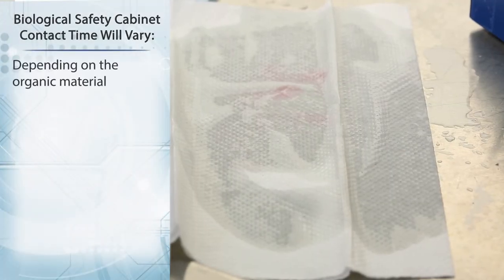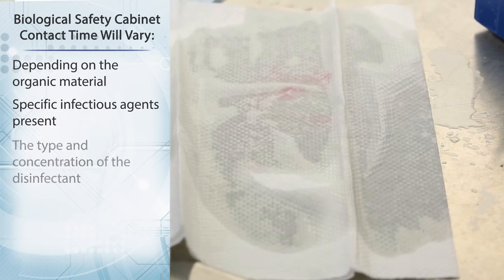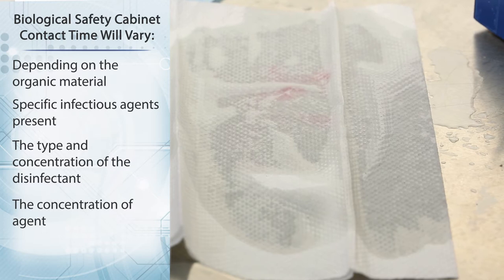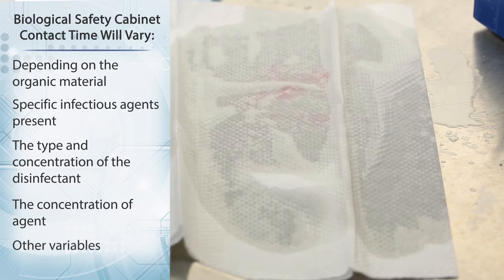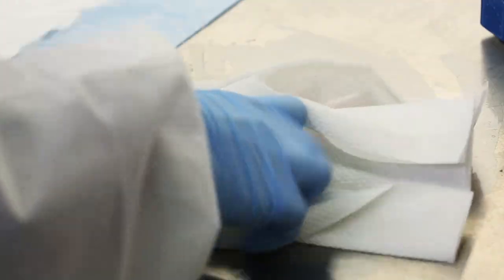Contact time will vary depending on the organic material and specific infectious agents present, the type and concentration of the disinfectant, the concentration of agent, and other variables. Discard the paper towels in the biohazardous waste container.